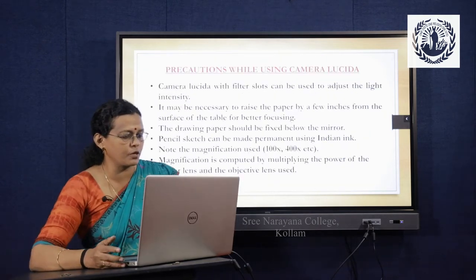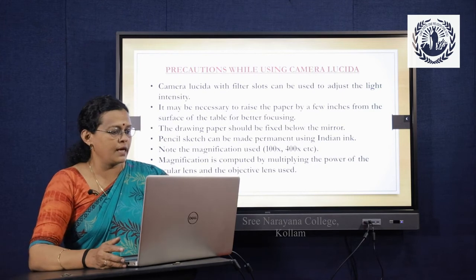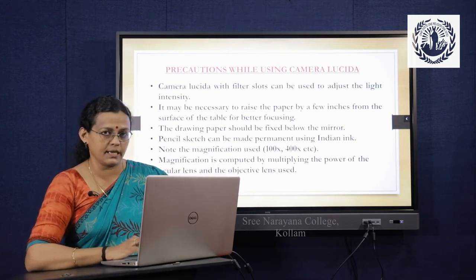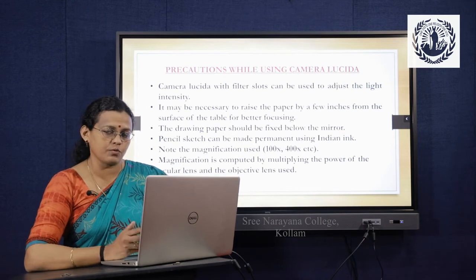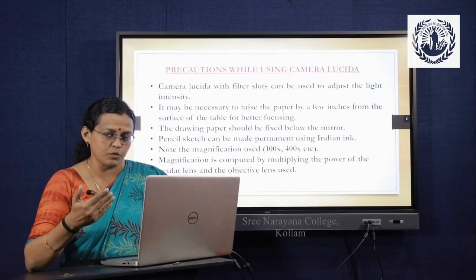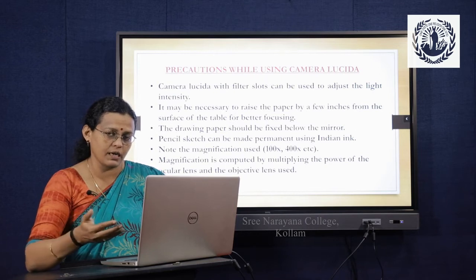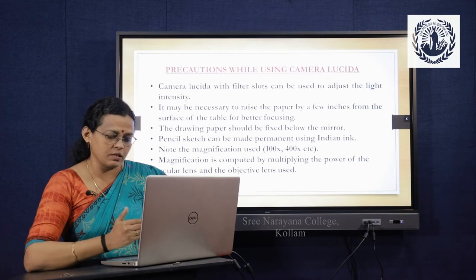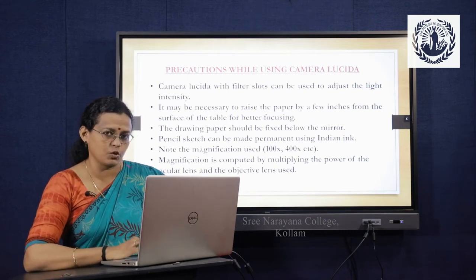Okay, these are some of the precautions that have to be taken care of. Camera Lucida with filter slots can be used to adjust the light intensity. So now Camera Lucida is available with filter slots, so you can actually adjust the light intensity. Some objects are visible under dark light, whereas some objects are visible under lighter conditions. With the help of filter slots, you can choose a light which is suitable.